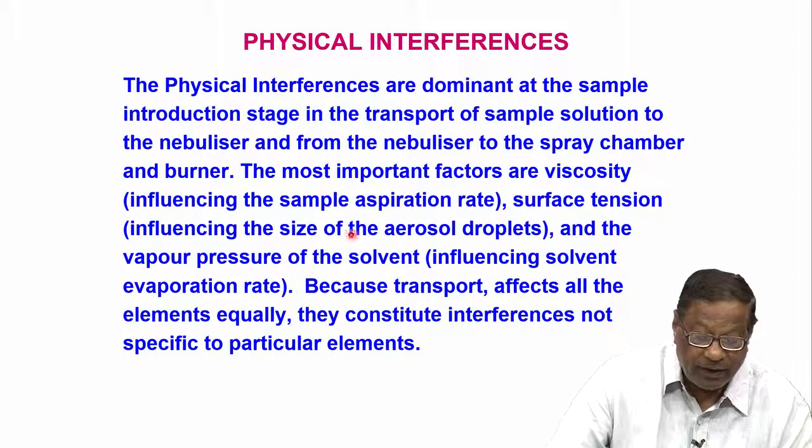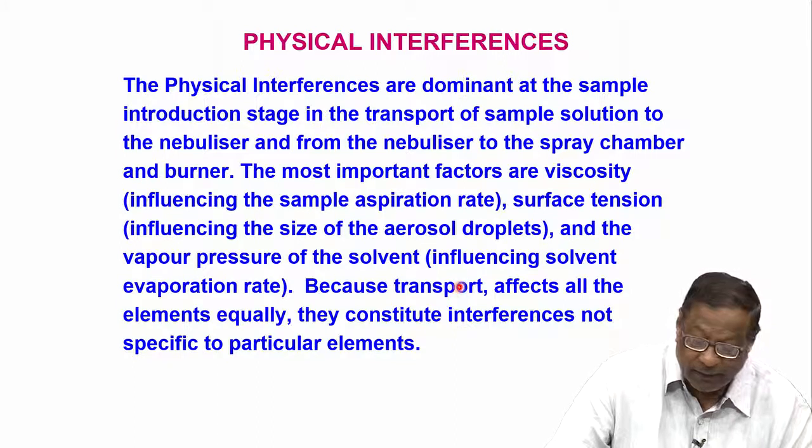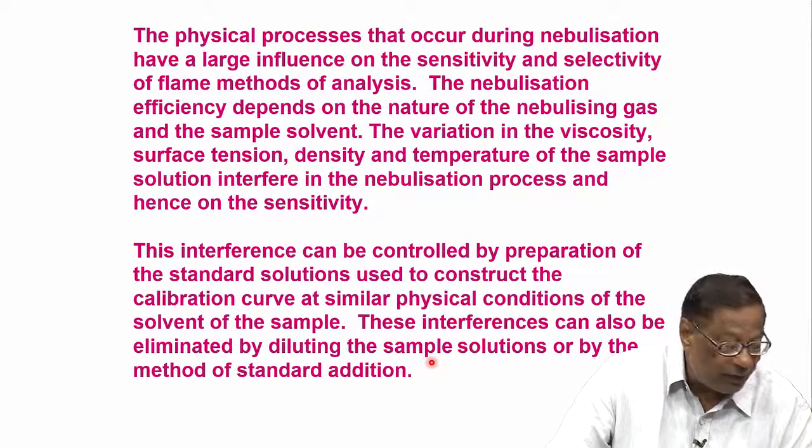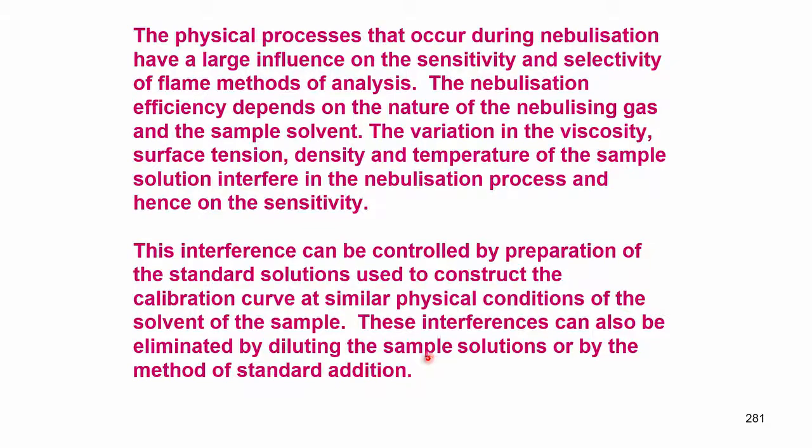Okay. So, physical interferences are there in the sample introduction stage, this we have already discussed a little bit earlier, and it all depends upon viscosity, surface tension, vapor pressure, etc. Because of the transport, it affects all the elements, but the signal becomes less. So, physical processes occurring during nebulization have a large influence on the sensitivity and selectivity. Nebulization efficiency depends on the nature of the nebulizing gas and the sample solvent. So, the interference can be controlled by preparation of standard solutions and by matching the solutions, etc. This we will discuss a little bit during the application of atomic absorption.